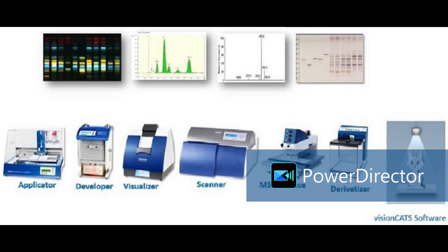Now these were all forensic applications. Some applications from herbal I will show you. In herbal analysis, Butea monosperma, red flower and yellow flower, we can differentiate between the two species, and this is the main difference. HPTLC fingerprint is unique for different species like Piper nigrum, Piper longum, Piper retrofractum, Piper cubeba, Piper borbonense. Same Piper family, Piper species, but different plants.